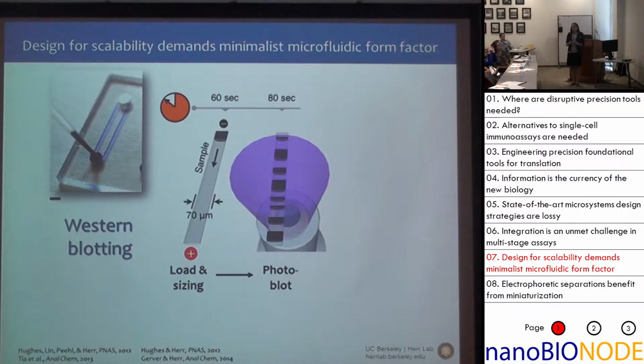But we have to somehow transition this from a separation into an immunoassay, right? And so the way that we did is using a very, very common photoactive moiety called benzophenone here, coupled with methacrylamide. So we're able to interlink that molecule with our polymer, this polyacrylamide gel. That lets us basically do sizing.